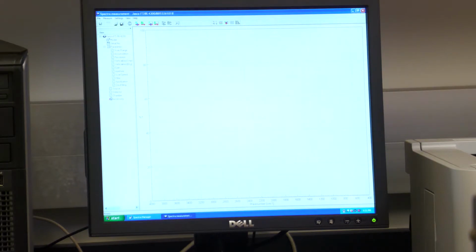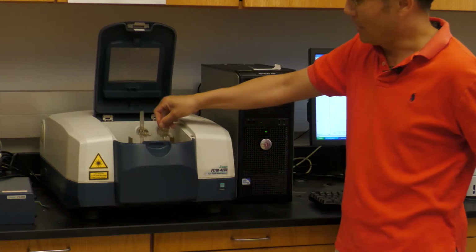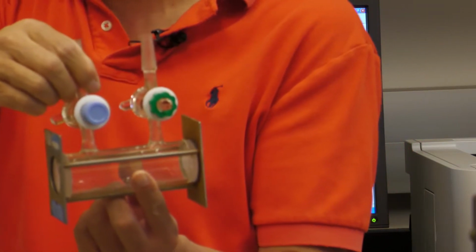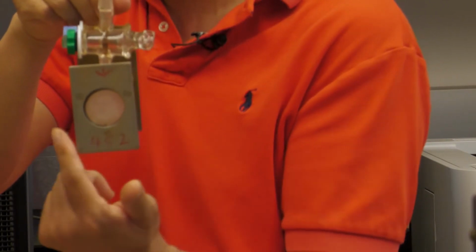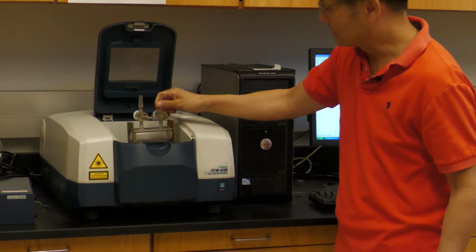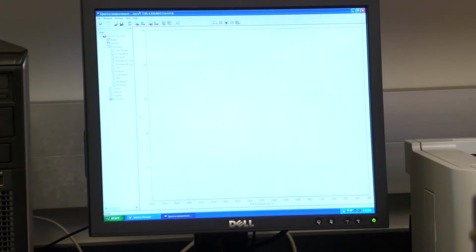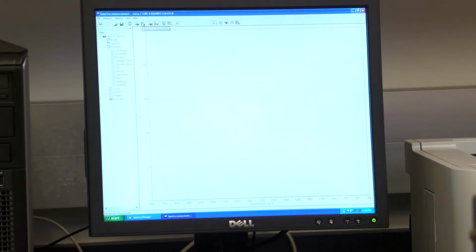The first one is we will put this one in without any HCl gas, just air inside, and we try to measure its background. We just slide in again, slide in this face, okay? With the arrow and 452, slide this one into the stand, and then cover this one, okay? Now let's just click the B here. That means we will take the background first, okay?